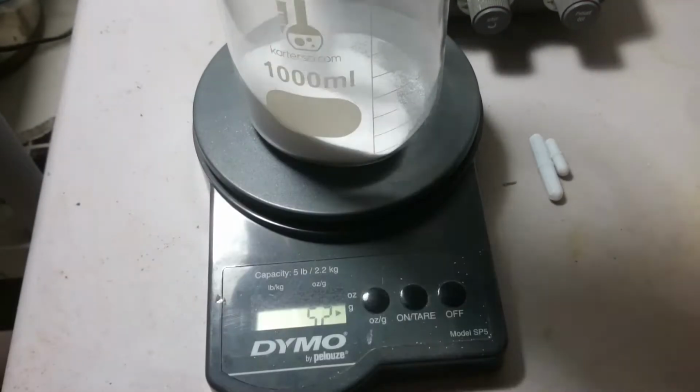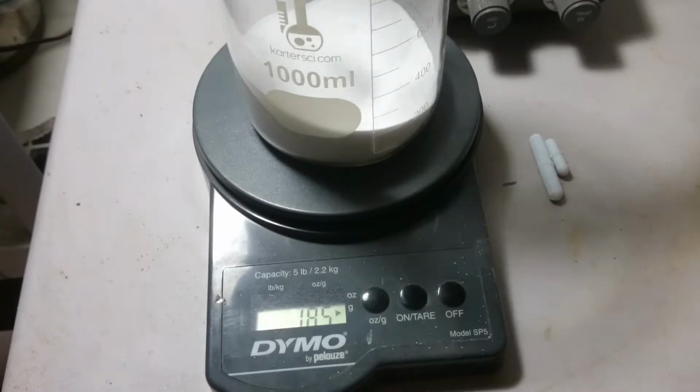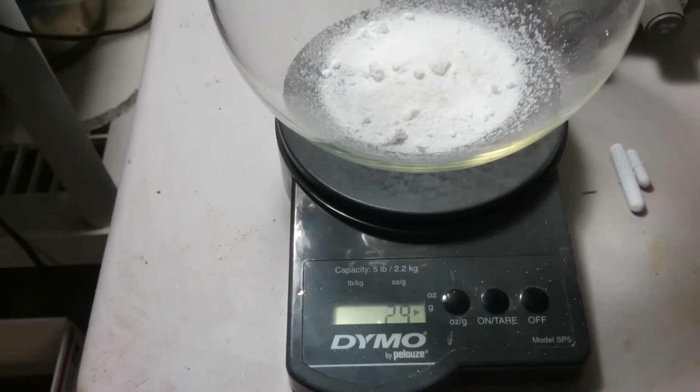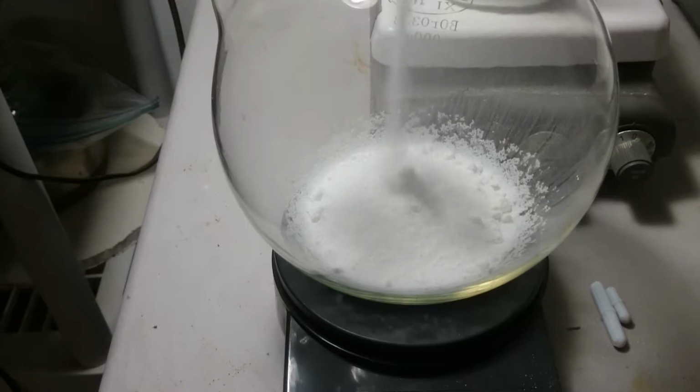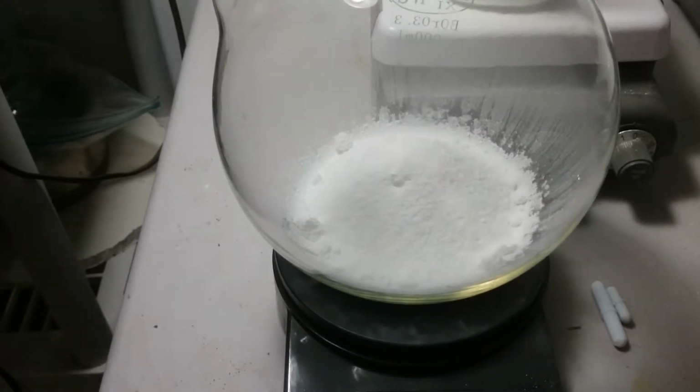So first I weigh out 1 mole of calcium propionate. This is easily obtained online as it's used as a preservative in baking. I have not been able to find sodium propionate online, or for that matter, simply propionic acid, so this seems to be the simplest way to produce propionic acid in a home lab.